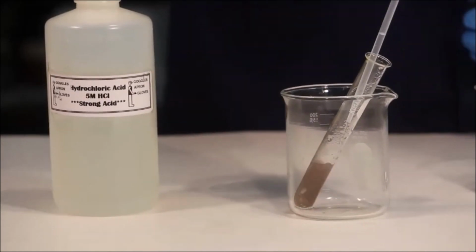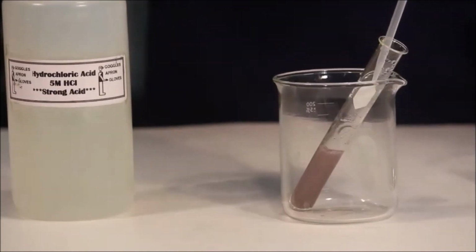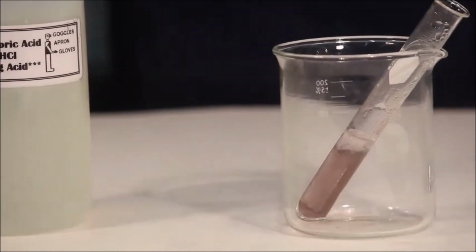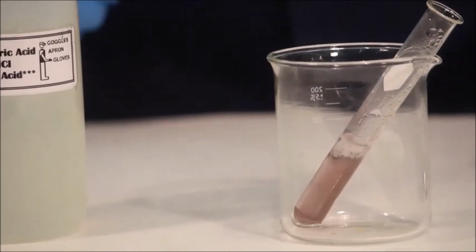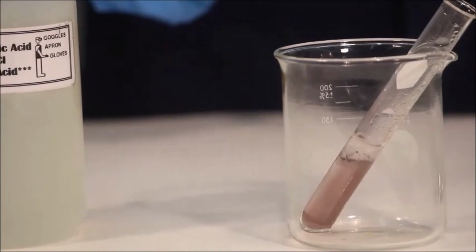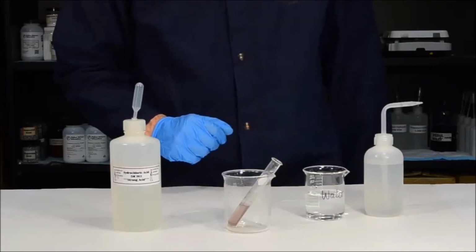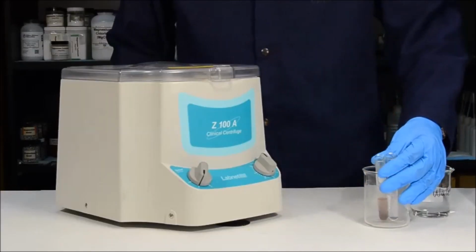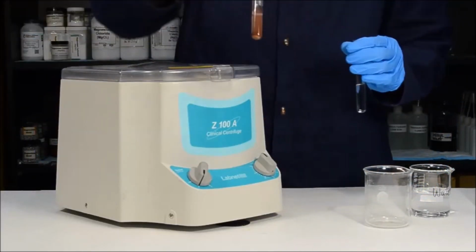When you add the HCl to the solution, you'll notice that bubbles immediately begin to form. This is a violently exothermic reaction and the test tube gets very hot. The bubbles are hydrogen gas, so it is very important that this part of the reaction is performed in the hood. After a few minutes, the magnesium will have completely reacted.